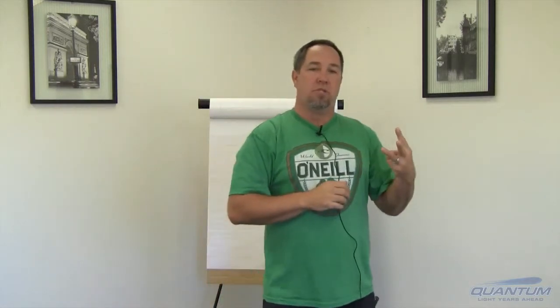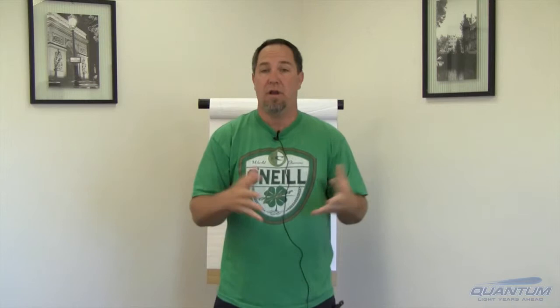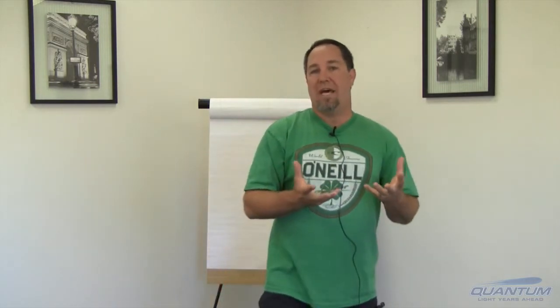You get 3 pulls to do 100% removal. The faster that it's removed, if you can pull it all off in the first pull, then you've got a really great anti-fouling compound. So that's what we're doing with that test, and that's a real quick rundown of what the methodology for that is.